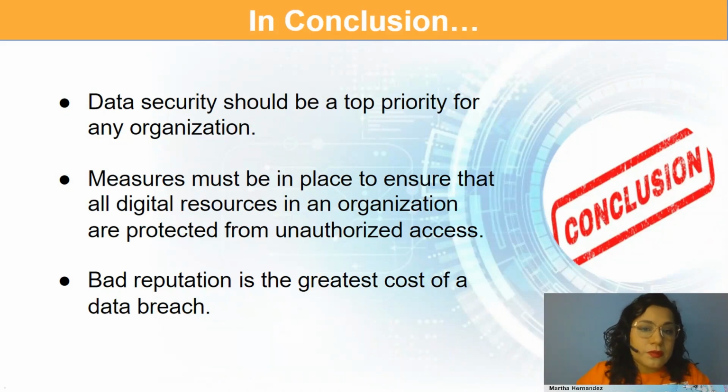So I give you here in this presentation some tips to improve your cybersecurity in your lab. And I think the LIMS could be a very, very good way to shield your laboratory with cybersecurity.